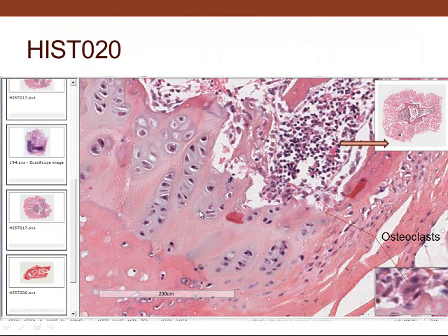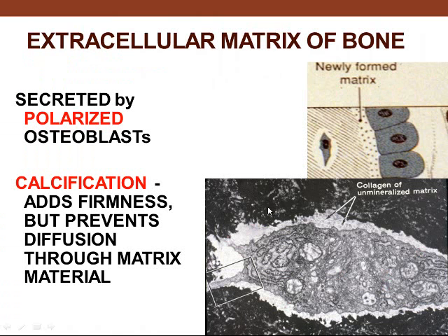So we have the hyaline cartilage in different areas: zone of reserve, zone of hypertrophy, and zone of hyperplasia, with increased number. Hyperplasia is increased number of cells. Hypertrophy is the increase in size of individual cells. So you increase the number and then the size of cells. And then you have osteoclast. There's an osteoclast right there. You can see it there, a multinucleated cell that will eat down cartilage and bone.